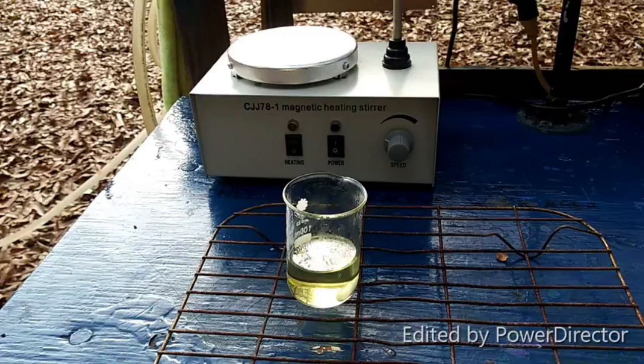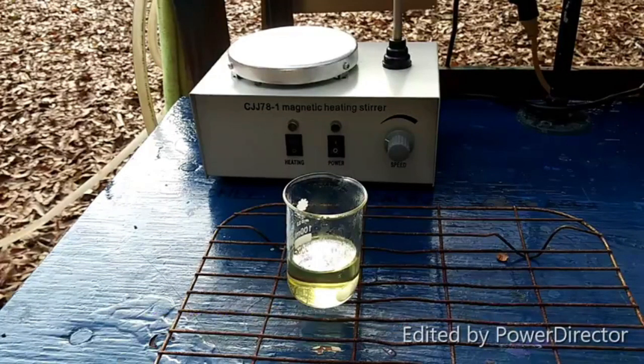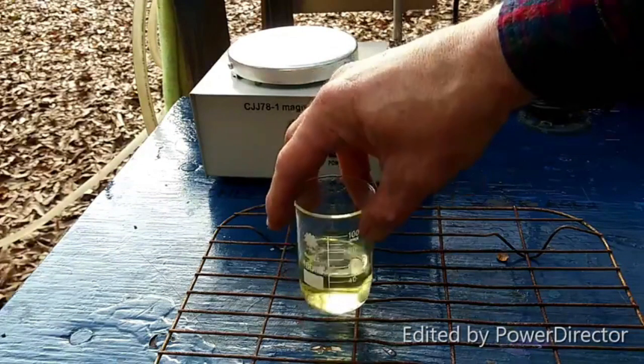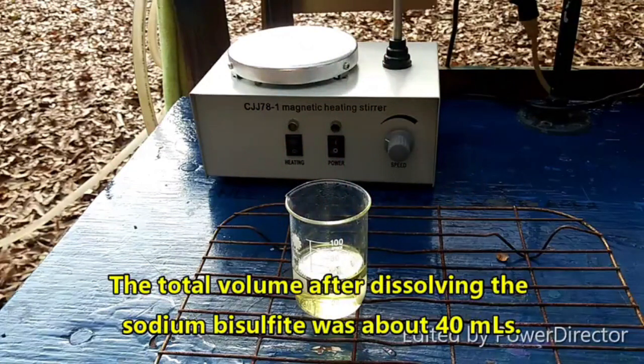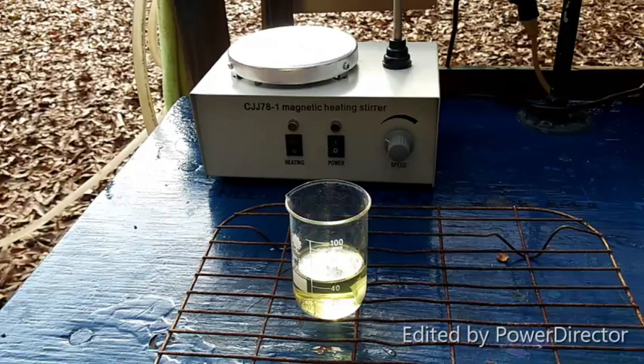It has to be stored under vacuum or else it will slowly decompose. What we're starting with is a solution of 25 grams of sodium bisulfite dissolved in 25 milliliters of water — the total volume ended up being a little higher than that. The protocol, taken from a website called Thomas's Chemistry, says to let it cool down to 20 degrees Celsius before proceeding with the next step, which will be the addition of zinc.